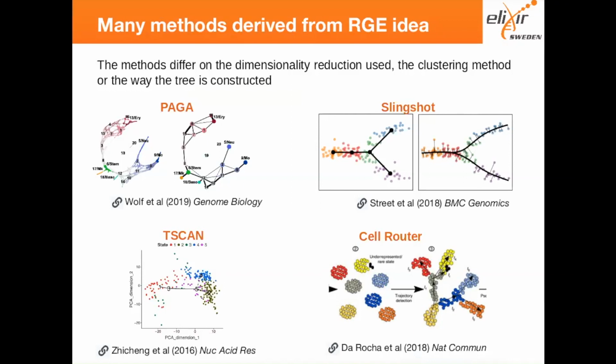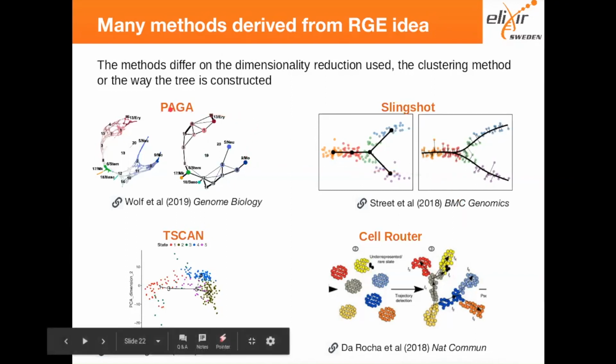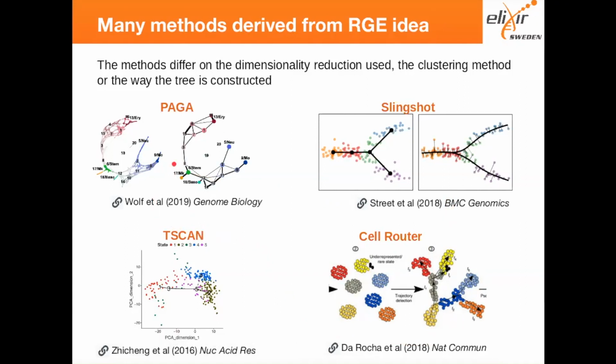As I was mentioning, there are many other algorithms. Here are also, I think, the newer ones, from this year, 2018, and many of them are basically doing exactly the same thing as DDRTree, or in some different ways. For example, here they are not using UMAP, nor TSNE.